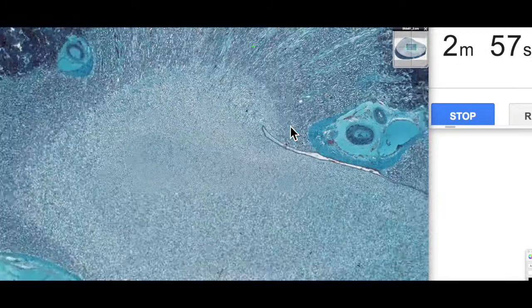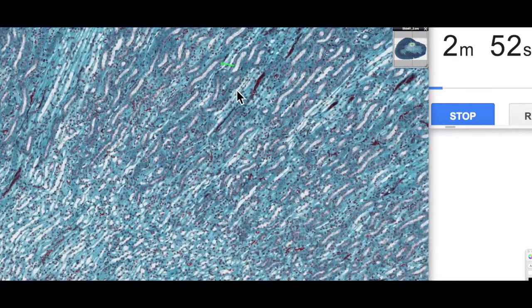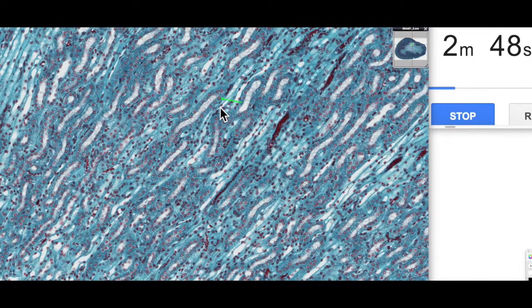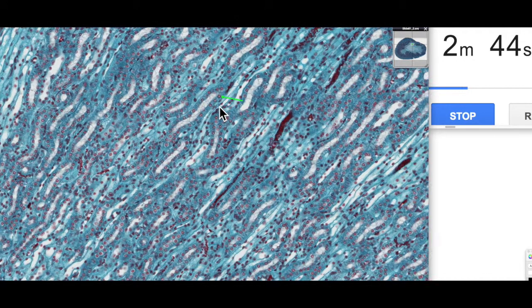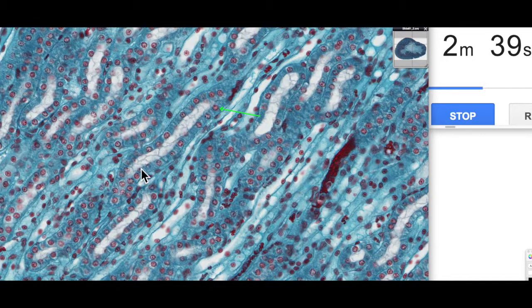I've highlighted a region here that shows simple cuboidal epithelium quite clearly. These are some of the renal tubules which are draining all the filtrate that's passed through the kidneys. You can quite clearly see these big channels here and then these blue cells with the more ready-looking nuclei, quite round, perfectly round spherical nuclei here.